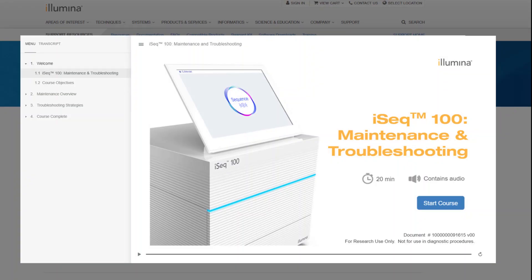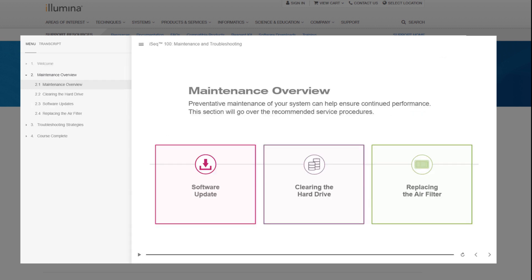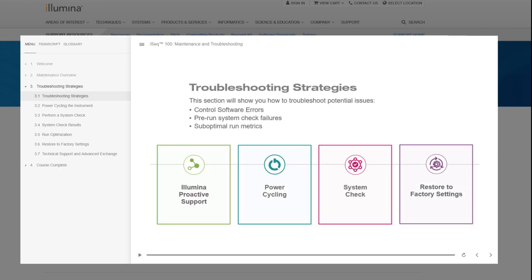Reviewing and performing preventative maintenance on your system can help ensure continued performance. However, you'll want to know what steps you can take if your instrument or run is not performing as expected. Illumina has two resources detailing iSeq 100 maintenance and basic troubleshooting to help ensure maximum uptime and productivity. The online course, Maintenance and Troubleshooting, is available on the iSeq 100 system support webpage. This training highlights procedures such as clearing the hard drive, replacing the air filter, and ensuring software is updated. The troubleshooting section will show you how to diagnose and correct potential system issues, including control software errors, pre-run or system check failures, and suboptimal run metrics.